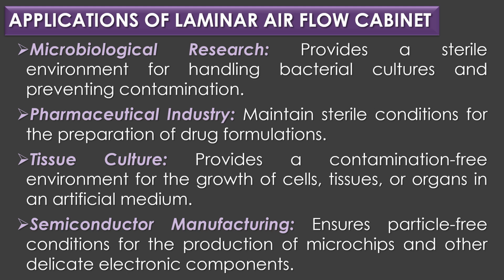Applications of laminar airflow cabinet. In microbiology research, laminar airflow cabinet provides a sterile environment for handling bacterial cultures and preventing contamination. In pharmaceutical industry, laminar airflow cabinet is used to maintain sterile conditions for the preparation of drug formulation.